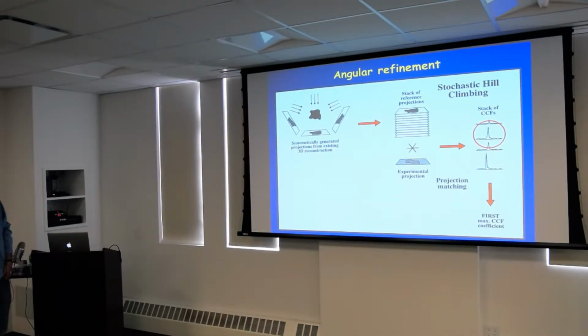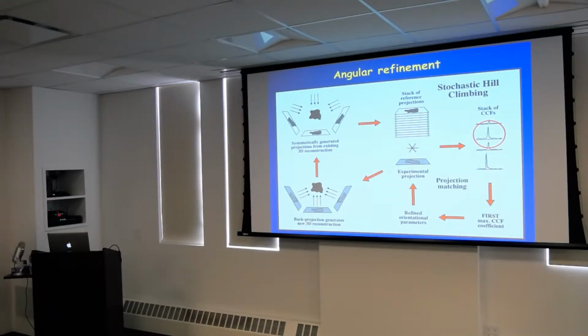So it's clearly not the best solution, because the best solution would be further back. But because you now really give the program a way to change the orientations, you can really change the problems with your map. And so by doing this, it's going to be slow at the beginning because it's not as good as this correlation, but this image or projection might give you a slightly different map and might start to correct your errors.